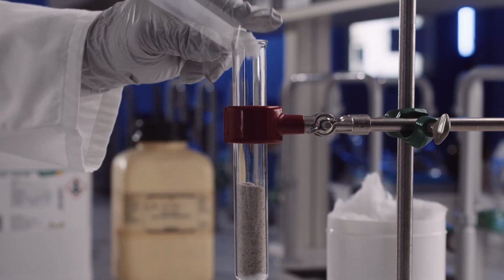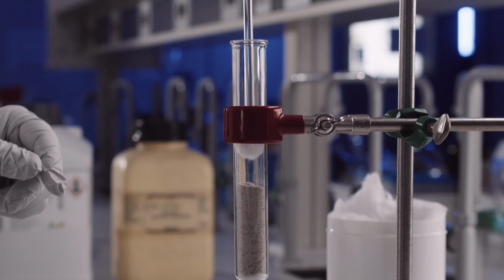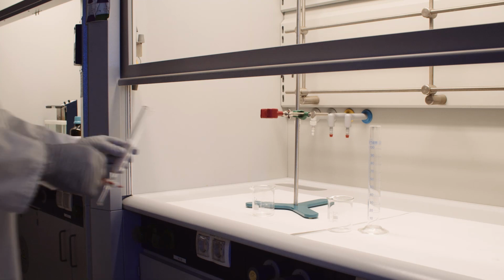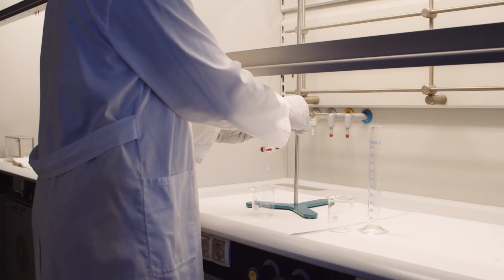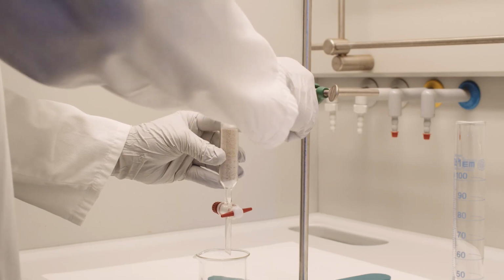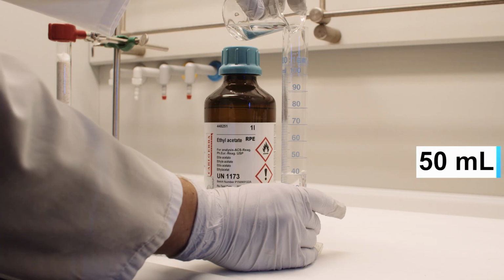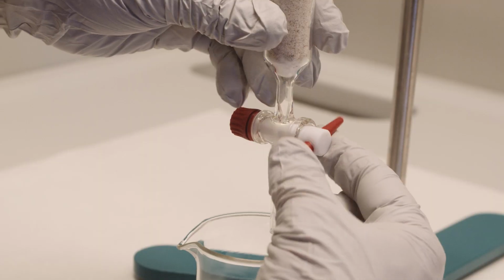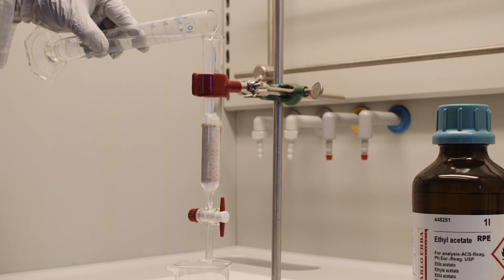Another piece of cotton wool is added to the top of the column to prevent the stationary phase from rising when rinsed with the mobile phase. Transfer the prepared column to a fume hood and clamp it in a stand. In a fume hood, we measure 50 milliliters of the mobile phase, which in our case is ethyl acetate. We begin to pour the mobile phase into the column.